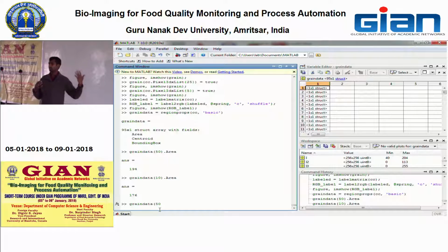Then the background is not uniform, so the second step we made the background as uniform as possible to segment our element from the background. Then the third step, we increased the contrast to get more separation from the background. Then using thresholding, we segmented the image from the background.